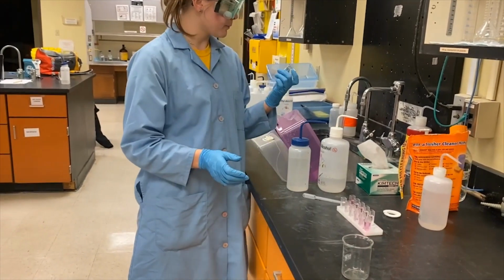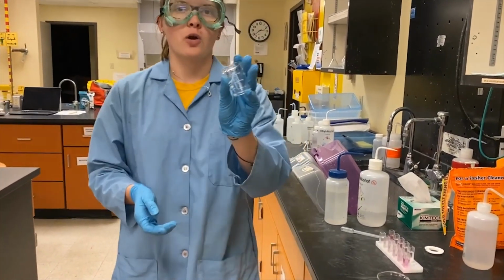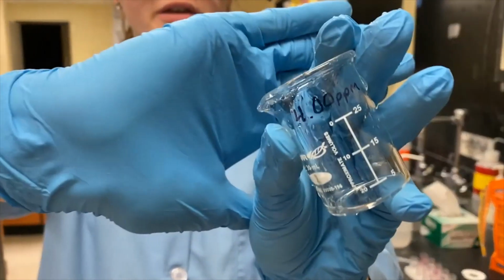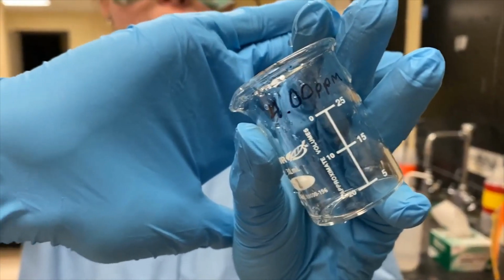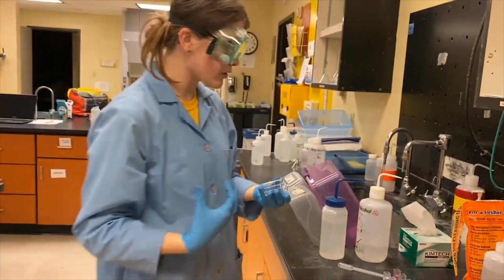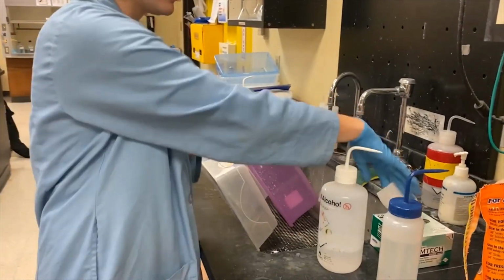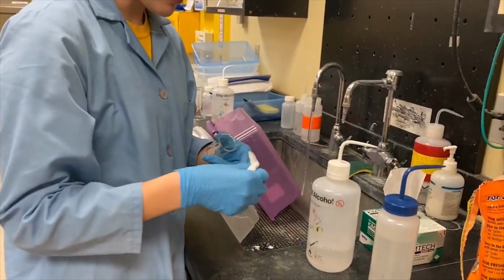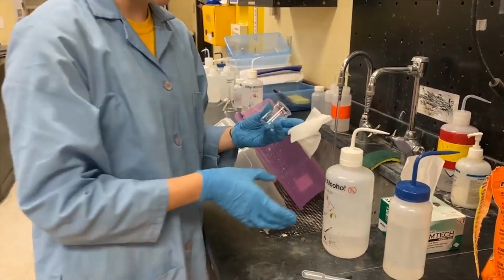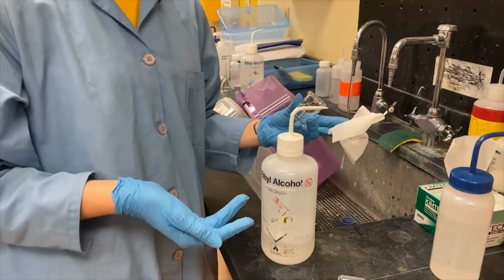And the last thing is this glassware is not completely dry. If you saw, we did the right thing, which was labeling the glassware, and now there's Sharpie on that. This will not always be filled with 4.0 ppm solution, so what we need to do is wipe that off as well. It's just common courtesy. Sharpie is usually pretty permanent, but something that does wipe it away is alcohol-based things.